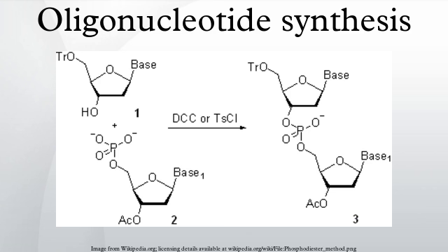By the use of additional steps in the synthetic cycle or alternative coupling agents and solvent systems, the oligonucleotide chain assembly may be carried out using dA and dC phosphoramidites with unprotected amino groups. However, these approaches currently remain in the research stage. In the routine oligonucleotide synthesis, exocyclic amino groups in nucleosides are kept permanently protected over the entire length of the oligonucleotide chain assembly. The protection of the exocyclic amino groups has to be orthogonal to that of the 5'-hydroxy group because the latter is removed at the end of each synthetic cycle.